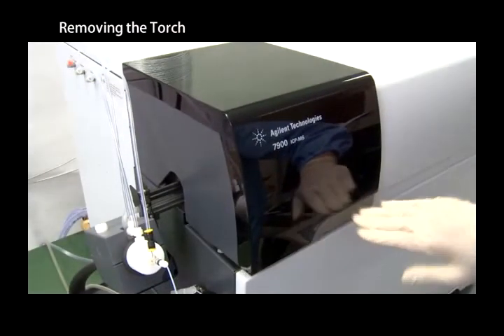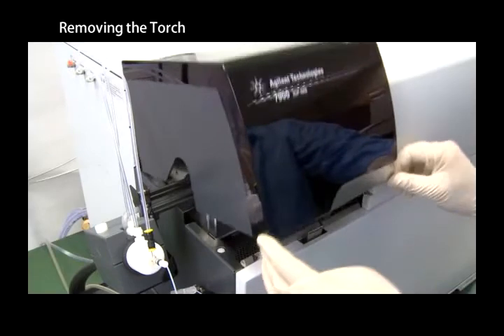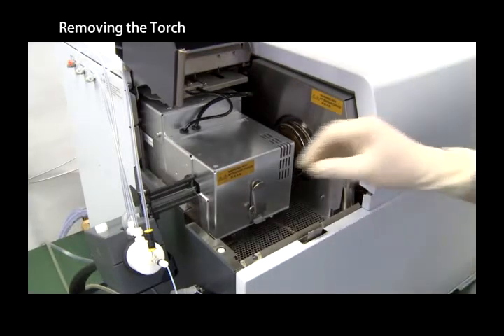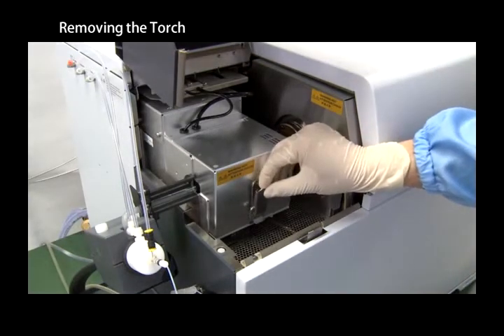Open the cover on the left of the instrument. Release the torch box clip and then remove the torch box cover.